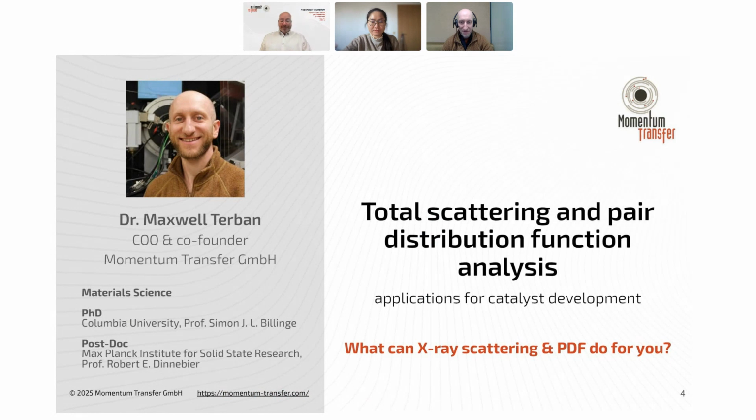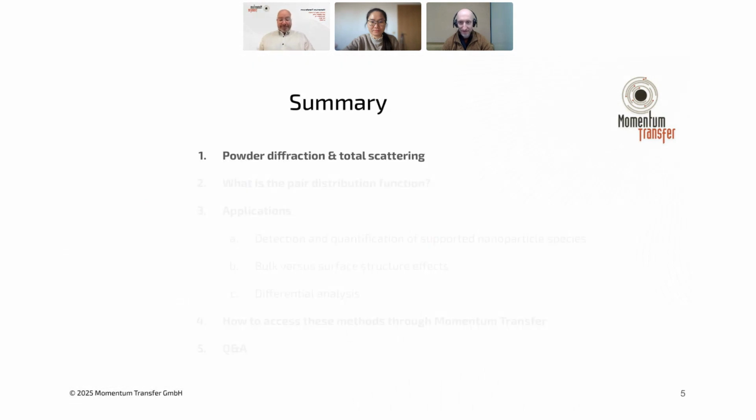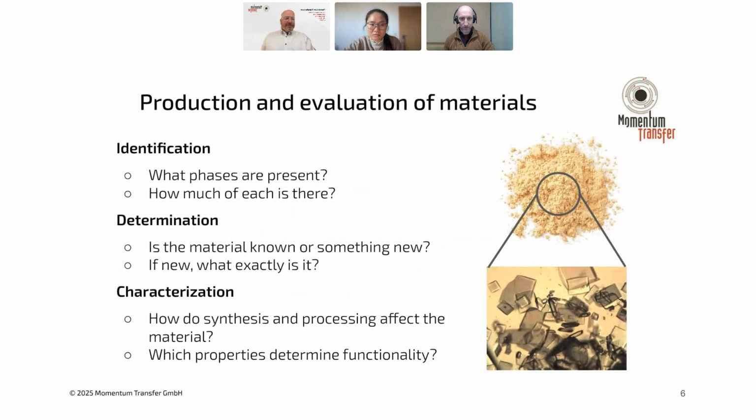Max. Awesome. Thanks, Sebastian. And yeah, I will try to answer that for you. So, just to get right into it, I will start with a short background on powder diffraction and total scattering, although I'm not really going to get too deep into the theory or the how-to in those respects, but just to give you a little bit of context of method fundamentals. But also just to contextualize what we're doing here.